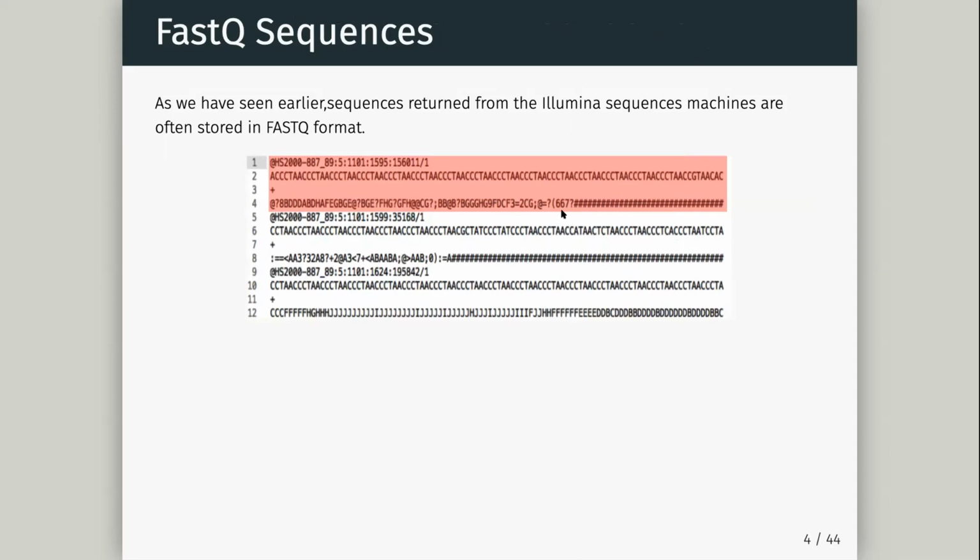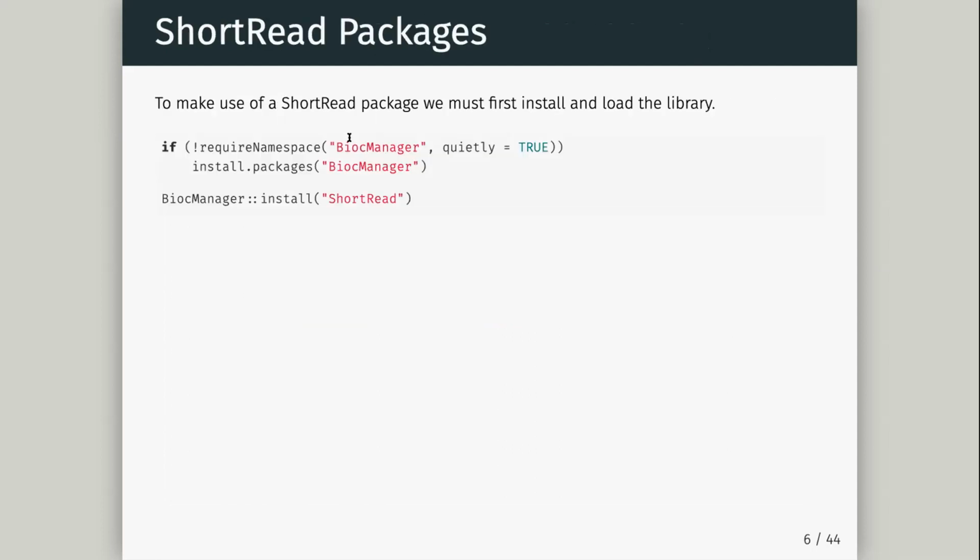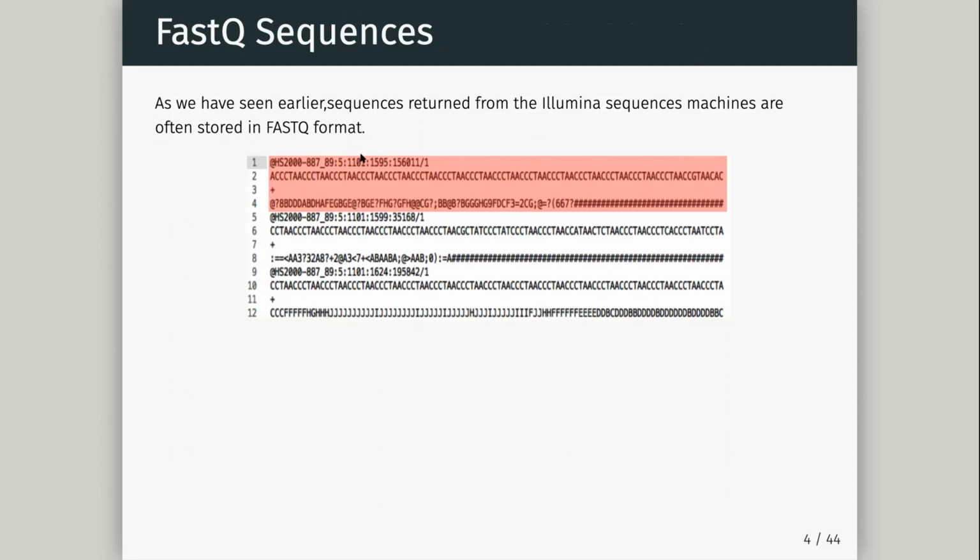So we saw earlier on, the product of this whole process is a FastQ file, right? And hopefully maybe we're going to come back to it, but we recognize some components of this. We have our read name, which is our kind of actual machine there. And then we have here the position on the flow cell.